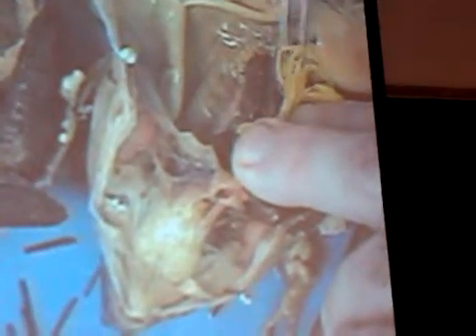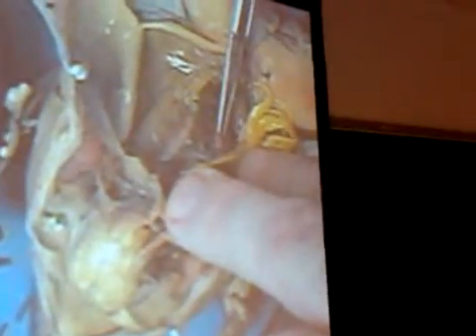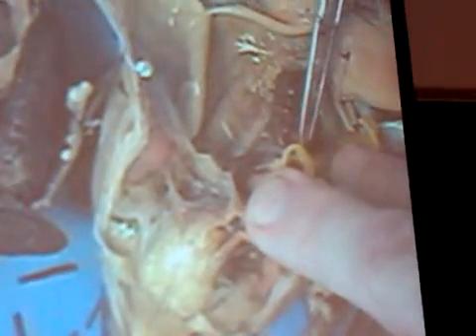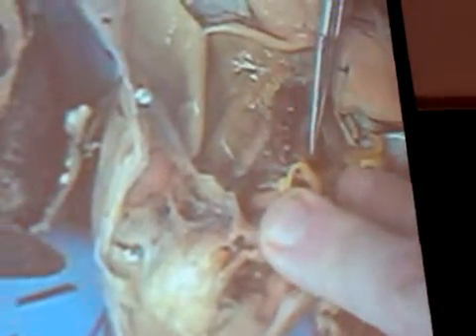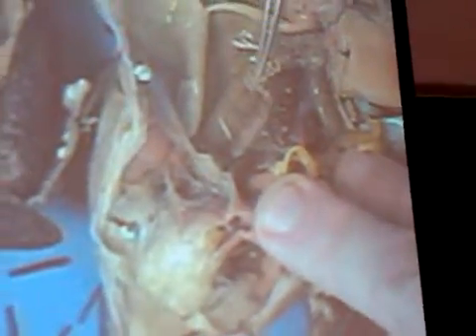Fat. Yeah, you want to say fat body. I'll take fat, but okay, fat body. And this is a male. That is a testis, right there. And here is a spleen. Let's see if I can actually get this to where we were actually looking at these separately. Does everybody see the spleen right here? Testis right there, spleen.